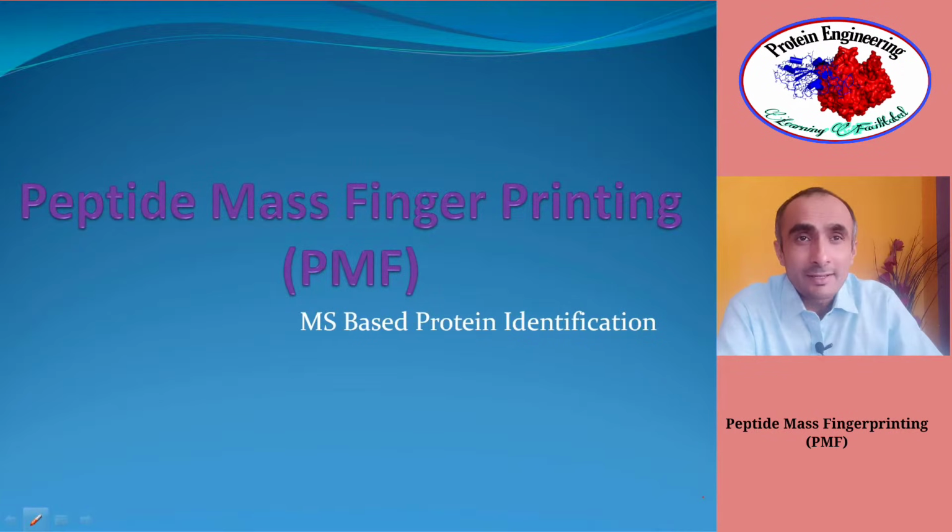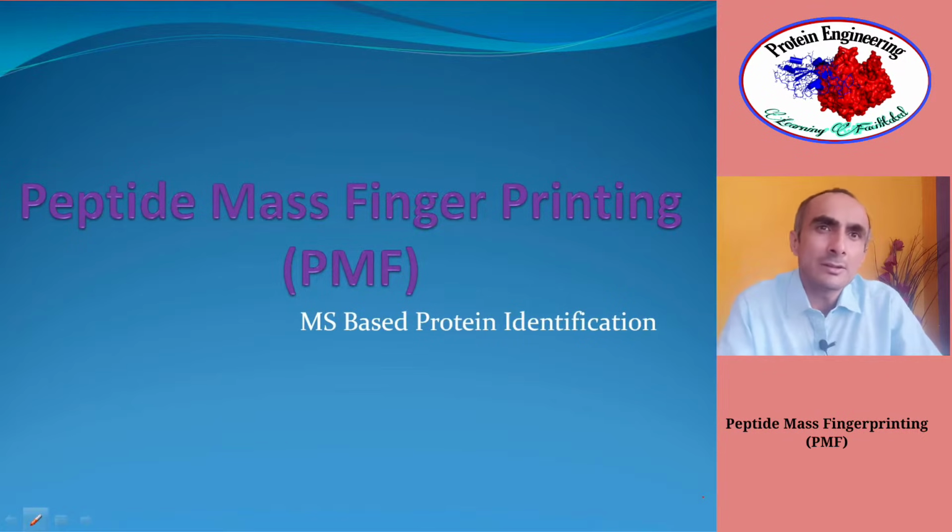Hello everyone. In today's lecture we will talk about peptide mass fingerprinting, PMF. It's a mass spectroscopy based technique which is used in proteomics laboratories to identify proteins.